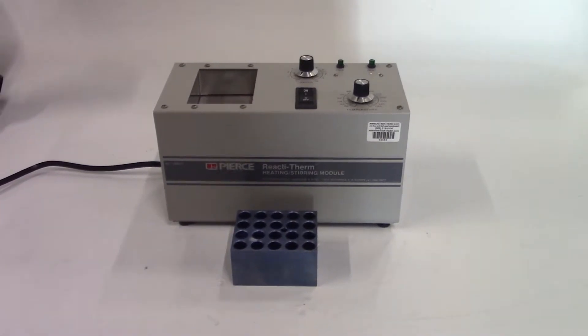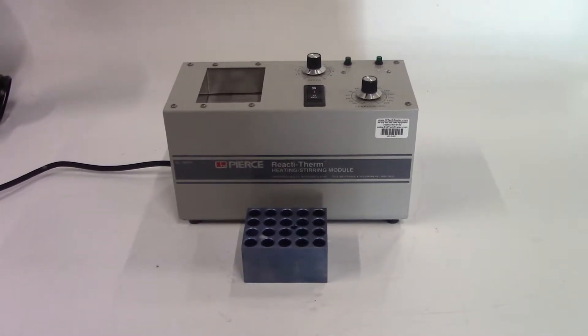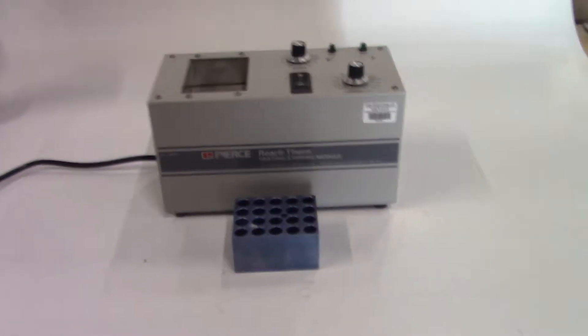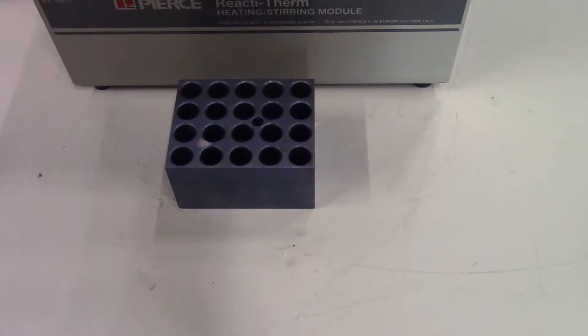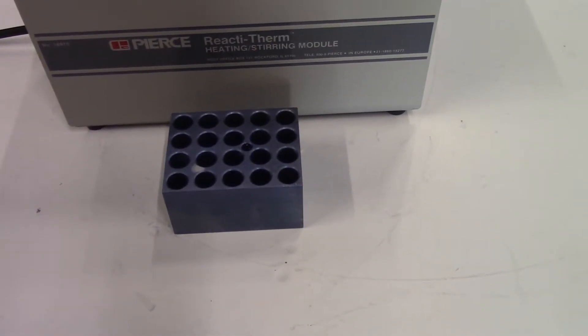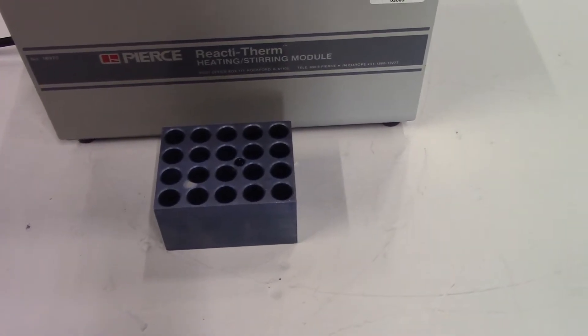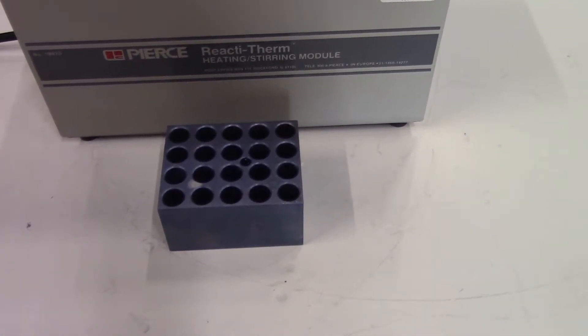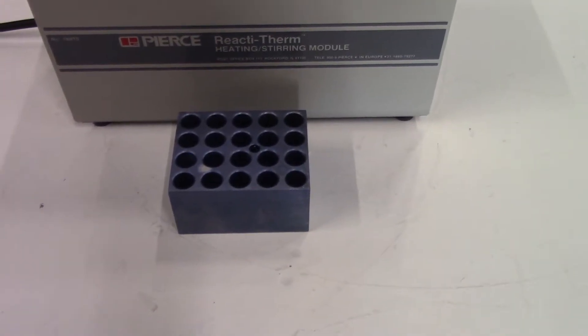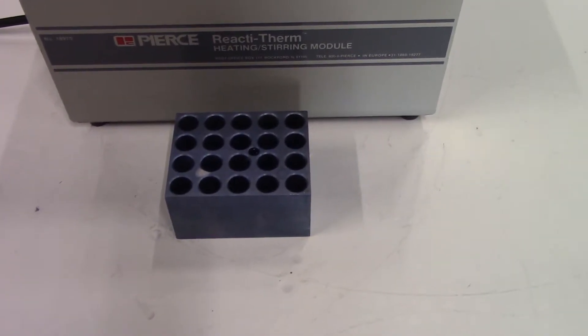Hi, this is Kevin from HitechTrader. We're looking at a Pierce Reactive Therm heating stirring module. It'll come with this tri-block which is almost 14 millimeters in diameter and there are 20 holes. It's about 550 thousandths diameter.